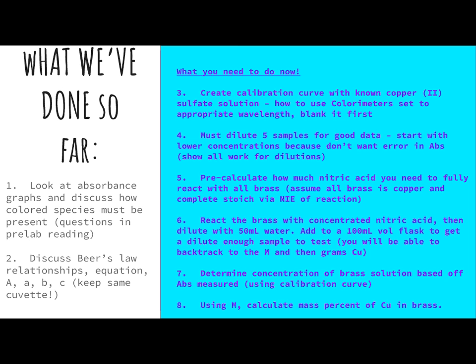Because right now you have this value. Is that 24?